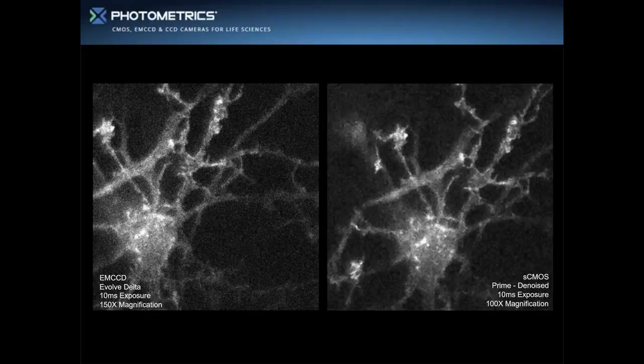And how about the longest exposure value for the 95B? Currently that is set to 10 seconds. Typically these cameras are used for much lower light flux, and exposure times range into the few hundreds of milliseconds at the most. By providing a max exposure time of 10 seconds, we're giving you a pretty decent range of flexibility. If you want to expose for longer periods of time, you should probably be using CCD technology. They offer much lower dark current than CMOS technology and are better for long stare applications.